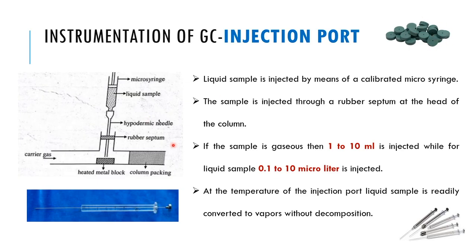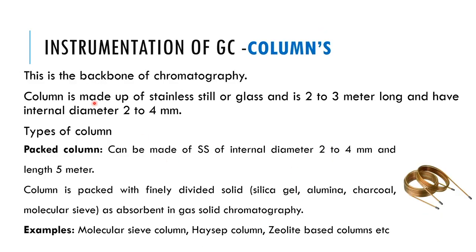But when we have a continuous injector, the scenario is a little different. Coming to the instrumentation of the GC, the columns. Let us discuss the column.